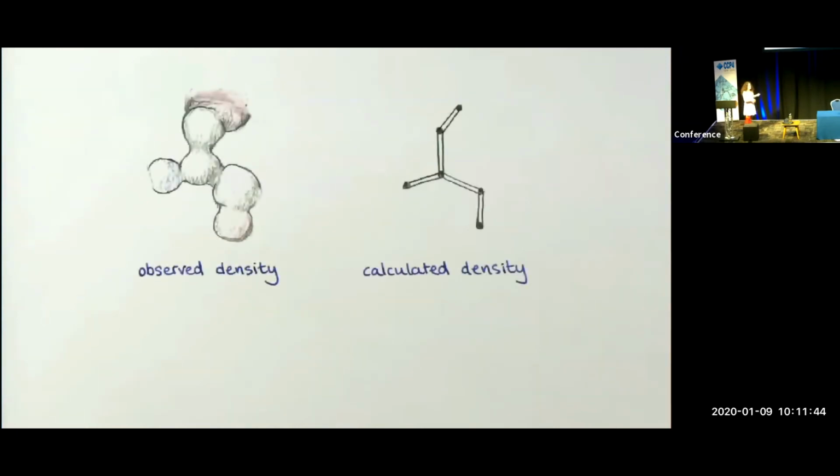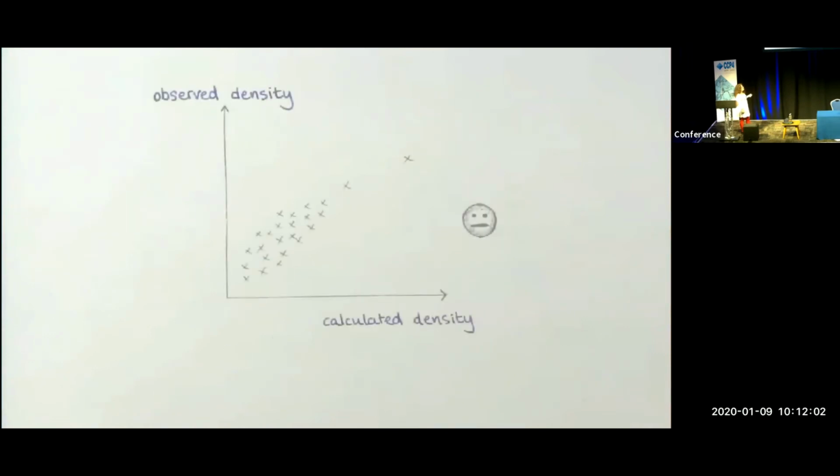If we then go back to our model and we try various things out, and one of the things that we might do is to introduce some variability in that terminal oxygen atom position, then when we calculate our electron density, we're going to better fit that disordered oxygen atom position, which means that when we have a look at the correlation graph, we go from an okay density to a stricter, better correlation coefficient, and this will be a good step, so we keep that step and then we move on to the next stage of refinement. So that's what happens on a local level.